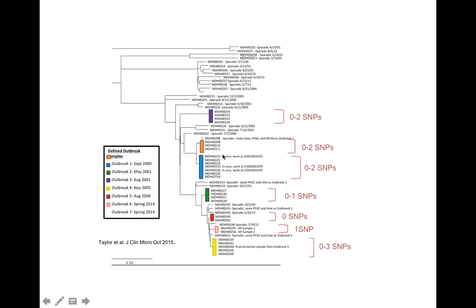But you can also see, if we look at the second outbreak from the top, we have 4 isolates that group very closely together, but one of them is a sporadic isolate that epidemiology did not link to the other isolates in this outbreak. So epidemiology, again, is essential to make sense out of these data. The communications between epidemiologists and the lab and environmental health or environmental investigators, if we investigate environmental sources, are very important to help us with the interpretation of these data.